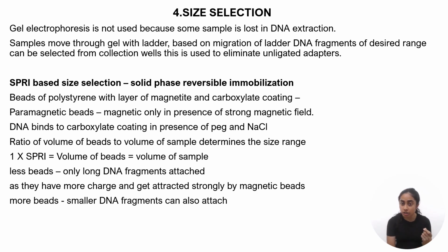So DNA has some charge. The longer the DNA, the more the charge. So that's why longer DNA gets attracted more easily to a smaller number of beads. And if there are more beads, then even the smaller DNA fragments get a chance to attach.